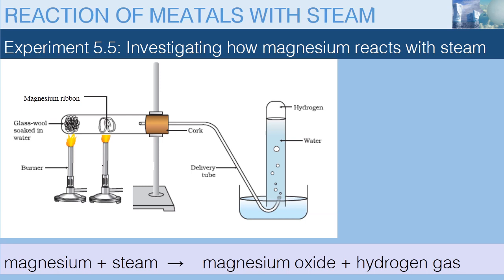Warming or heating the glass wool, like you see in this setup, introduces steam into the test tube, and we are able to react magnesium with steam.